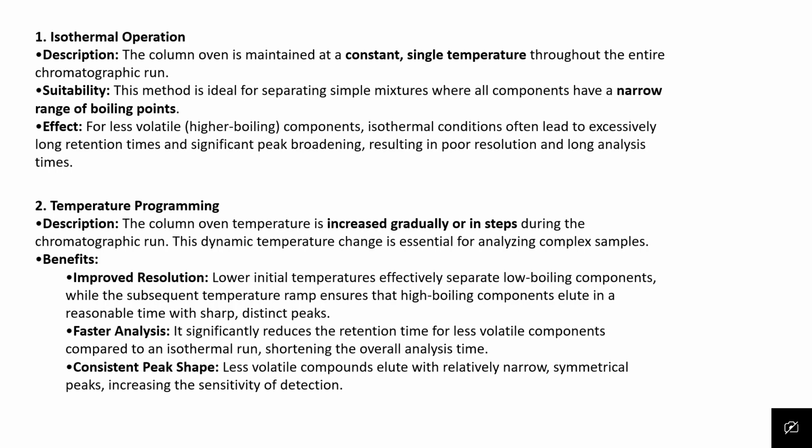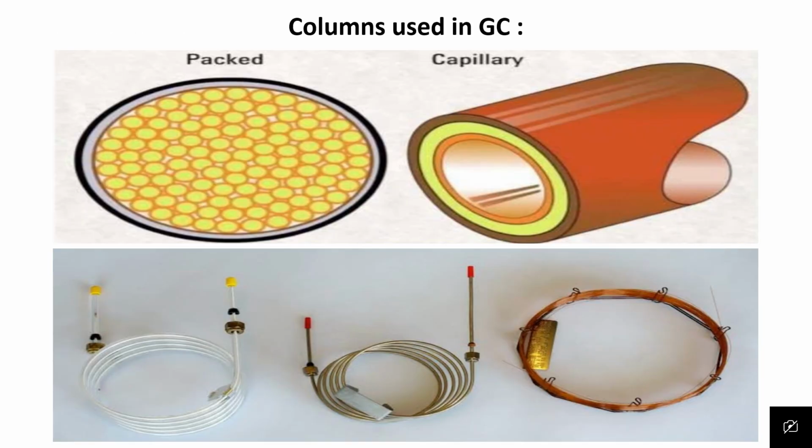Faster analysis. It significantly reduces the retention time for less volatile components compared to an isothermal run, shortening the overall analysis time. Consistent peak shape. Less volatile compounds elute with relatively narrow, symmetrical peaks, increasing the sensitivity of detection.